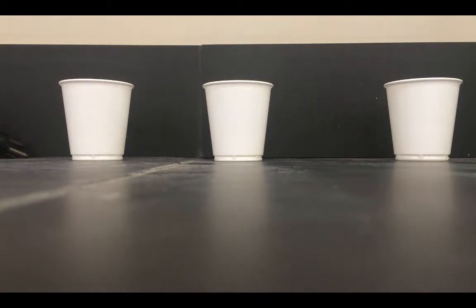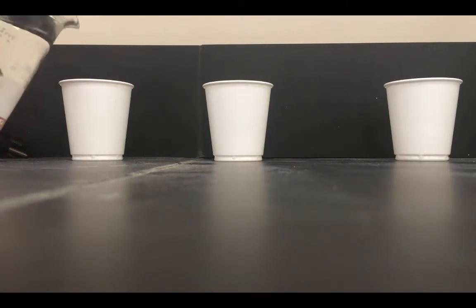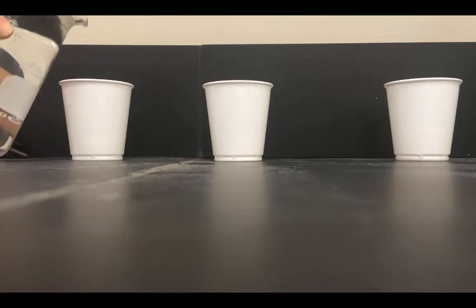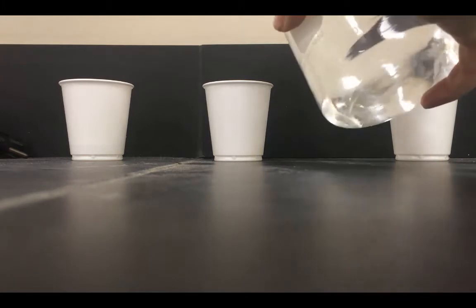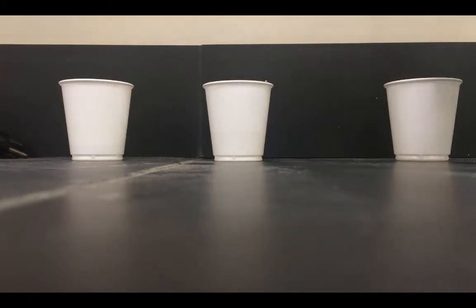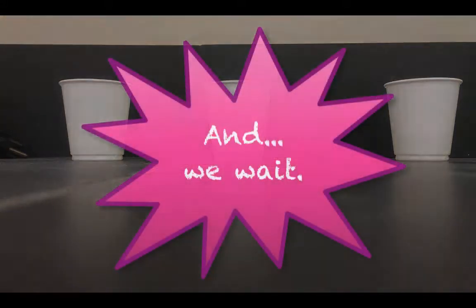Now what we're going to do is add some warm, well-dissolved gelatin into each cup, just enough to cover the pineapple pieces. There is the setup. Now all we have to do is wait.